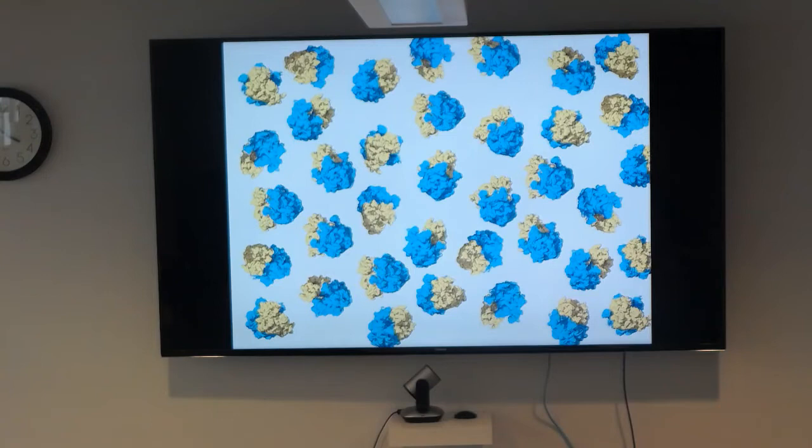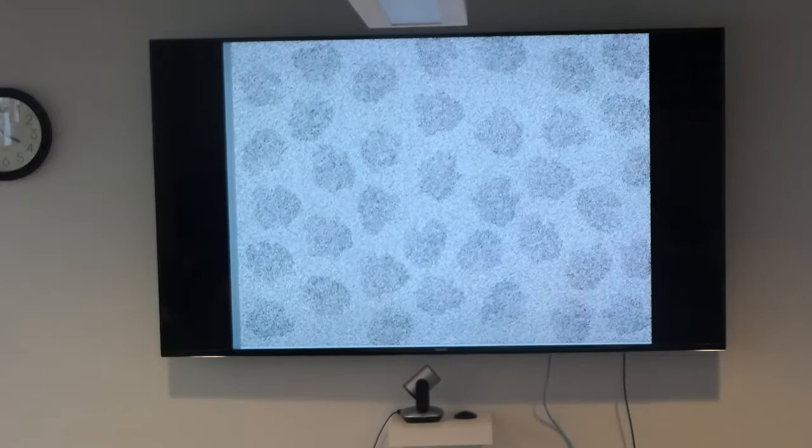And so somewhere along the line, there's all of a sudden this trapping, the deep freeze. There's one moment. And so each molecule, you have to imagine, is now trapped in exactly the state that it was in immediately before. The salt and pepper appearance, which is simulated here, occurs because of the shot noise effect, because we need to go down with the electron dose in order to avoid radiation damage.